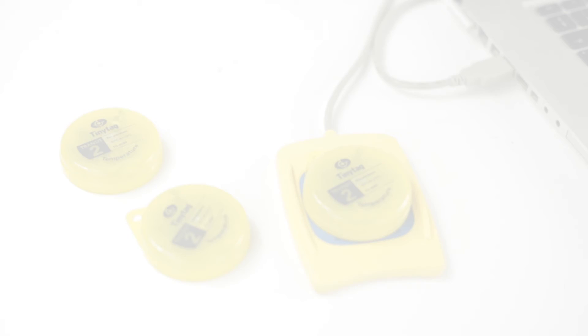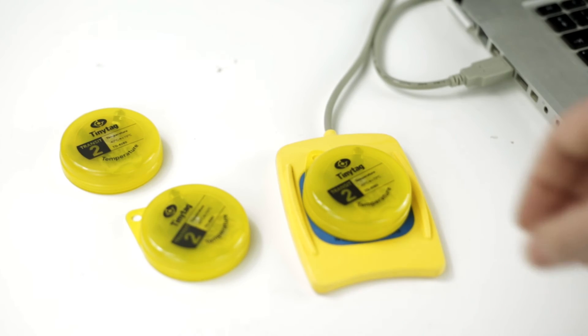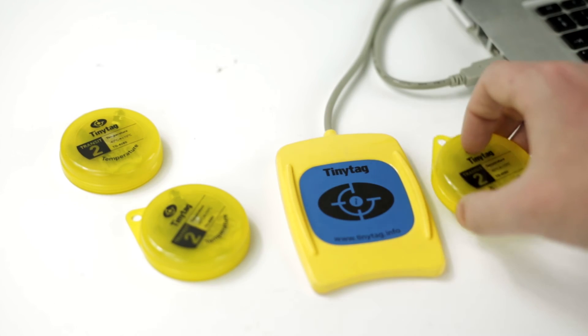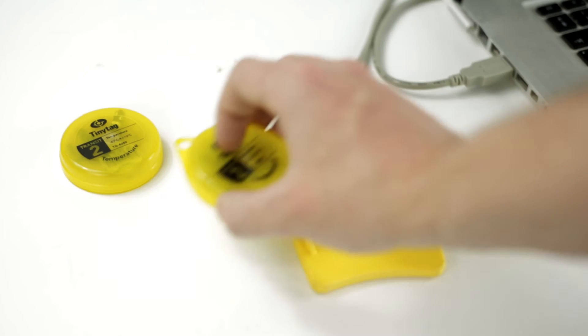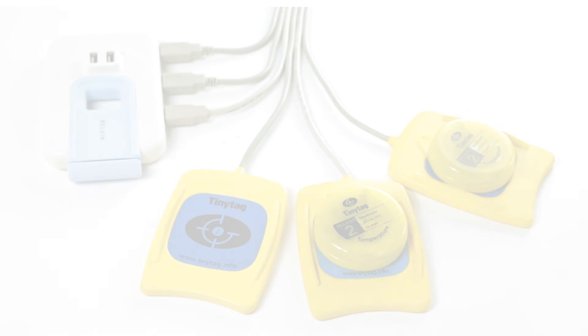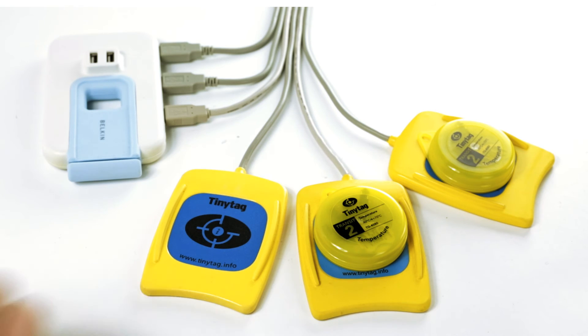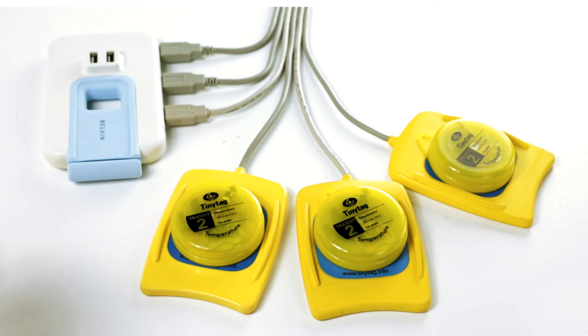The first data logger is configured and then successive units are programmed with the same settings. The configuration only has to be entered once. Loggers can be programmed or offloaded in turn using a cable or inductive pad.